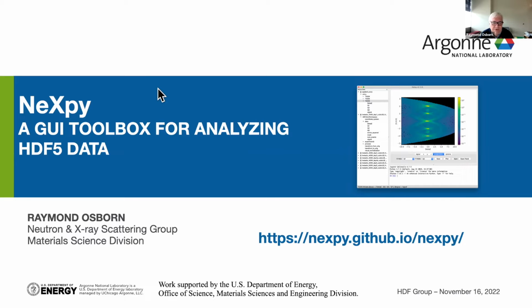HDF5 has been central to our work for actually pretty well over 20 years. I don't know when it first was released, but we've been using it in the Nexus world since at least 2001, if not earlier. But this is not going to be a talk about Nexus specifically.